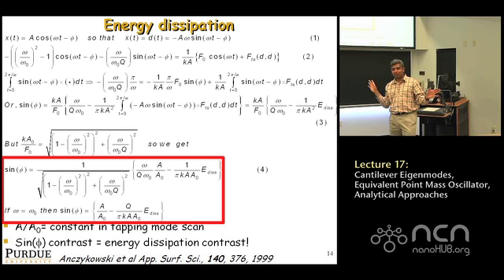How many electron volts of energy? Because these are tiny oscillators interacting. After all, the interactions are between a few hundred atoms here and a few hundred atoms there. We're simply mapping out, when this happens, how much energy was lost. It's amazing. It's the smallest energy loss that you can mechanically measure, if you think about it.